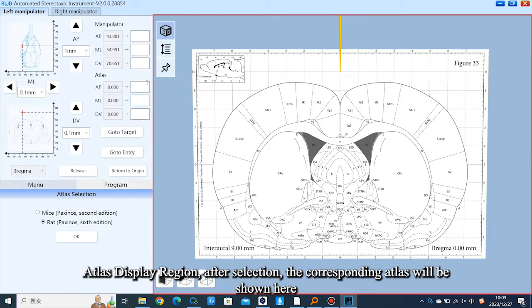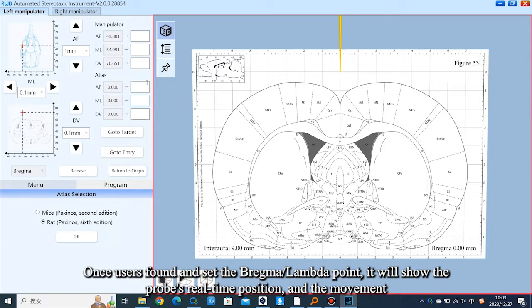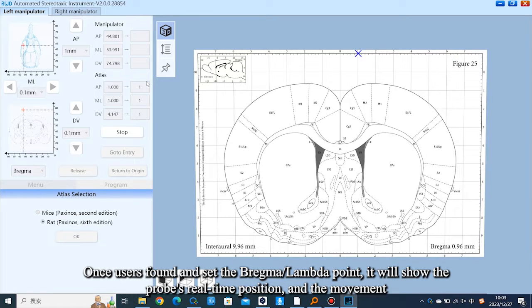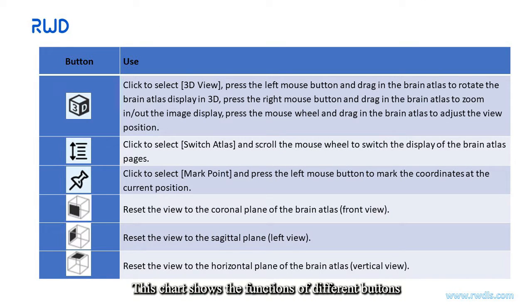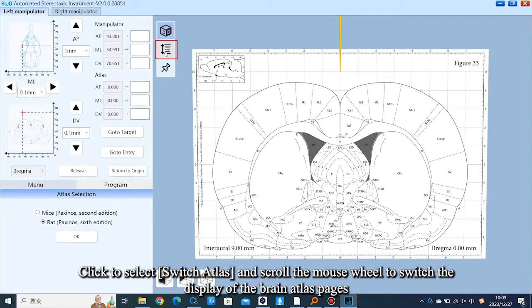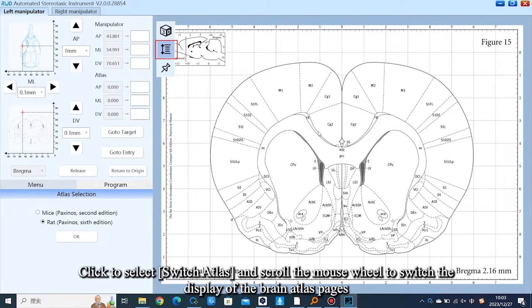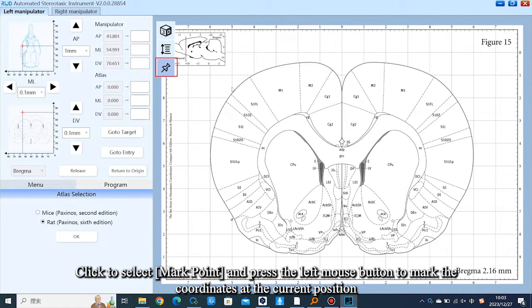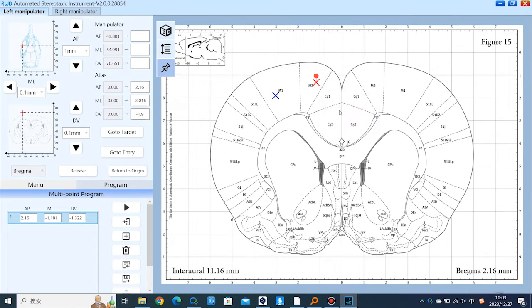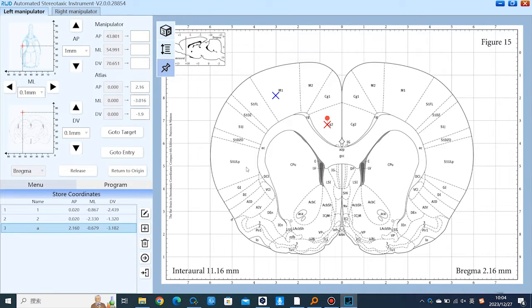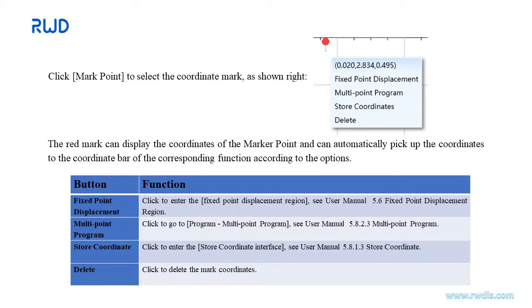In the ATLAS display region, after selection the corresponding ATLAS is shown. Once users find and set the bregma and lambda points, it will show the probe's real-time position and movement. Click to select Switch ATLAS and scroll the mouse wheel to switch the Brain Atlas pages. Click to select Mark Point and press the left mouse button to mark the coordinates at the current position, including fixed point displacement, multi-point program, and store coordinate. Please check the chart and user manual for more details.